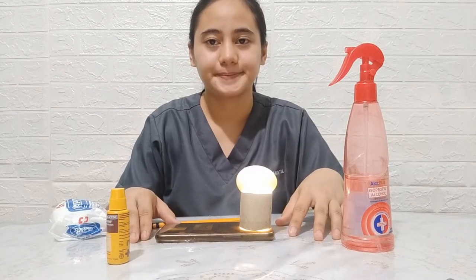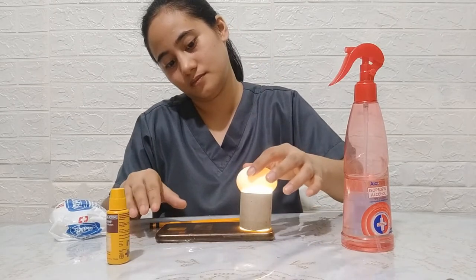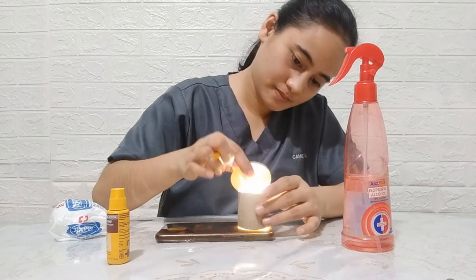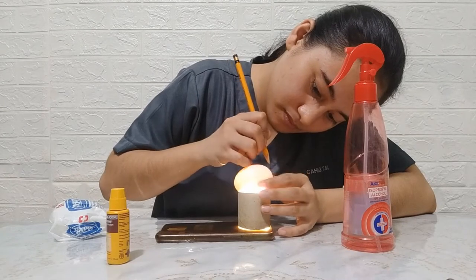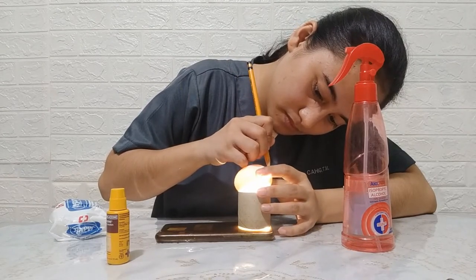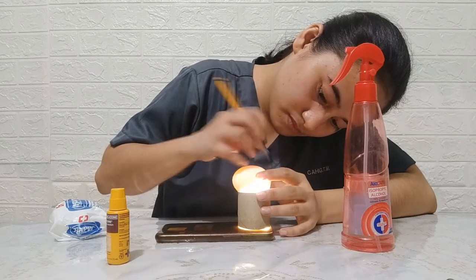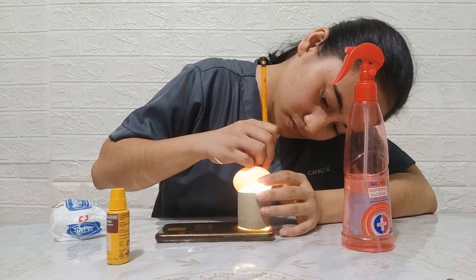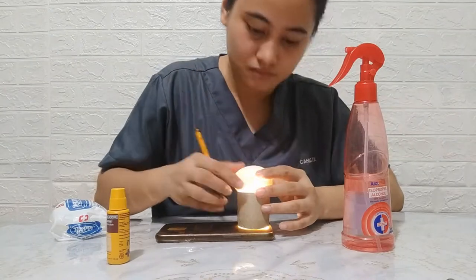Using a candler, the egg is checked. An improvised candler can be used, which is composed of an empty paper roll and a cellular phone torch. Place the blunt side of the egg onto the light source of the candler. Mark the air cell, the location of the embryo, and blood vessels of the embrionated egg. This will enable the handler to see the parts of the egg clearly and inoculate the virus properly.